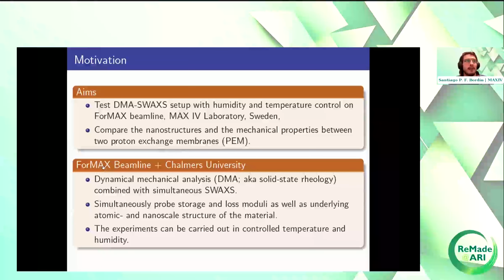This setup was developed between the ForMAX beamline at MAX IV and Chalmers University. We are using dynamic mechanical analysis combined with simultaneous SWAXS, which allows us to probe storage and loss moduli as well as the underlying atomic and nanoscale structure of the material. And the experiment can be carried out in controlled temperature and humidity. That's a really complex setup. It's available now, so you can apply if you are interested.